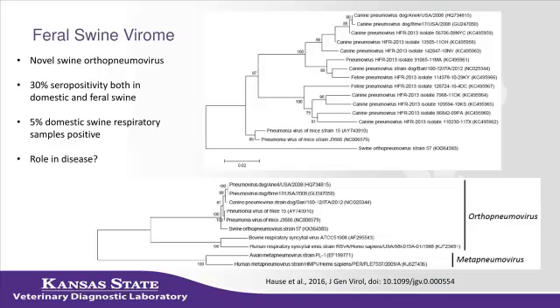We did do some serology on both domestic and feral swine samples. We found about 30% were positive. We also did PCR and went back and looked at domestic and feral swine nasal swabs and found about 5% of domestic pigs were positive.